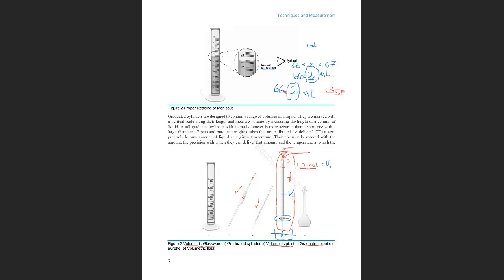And then you will have a beaker here with an amount of water, and you want to know the volume of that water. If the final volume is, let's say, 5.7, can somebody tell me what is the volume in this beaker? Initially, I had the liquid here, then I open the stopcock, drain some of the liquid, and close it. The amount of liquid in this beaker is just this. So it will be 5.7, the final volume, minus the initial volume.